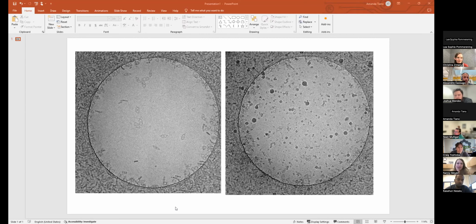Yep. So you mentioned these are DNA cages. They're DNA origami structures. Do you do anything to change the charge on the carbon specifically because of the DNA content? I'm just curious. The glow discharge condition? Okay. Yeah, the glow discharge condition is very high.